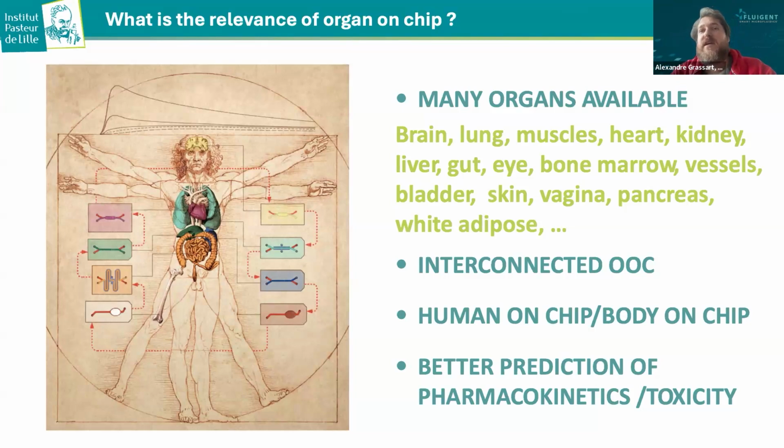And so there's this idea of a human on chip or body on chip, with the dream being to better predict pharmacokinetics and toxicity.